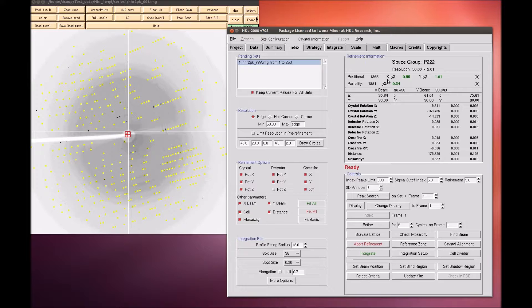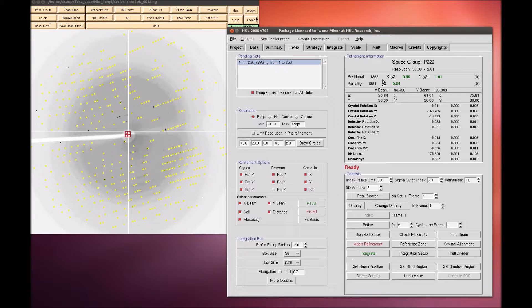The peak search data is saved in a file, so the peak search does not have to be performed again unless you want to change the peaks you are working with.